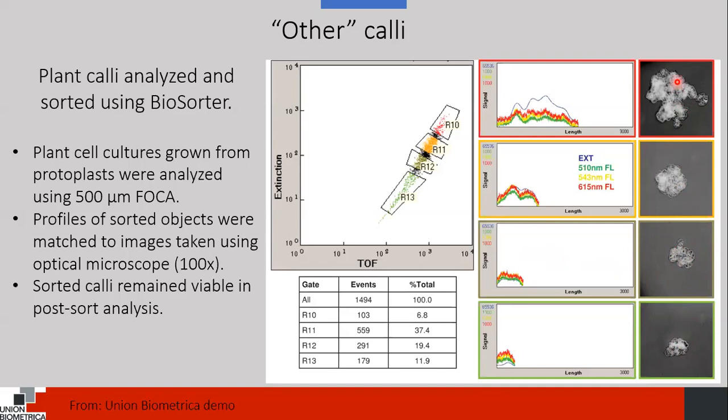And it's quite likely that cell clusters of different sizes are undergoing different kinds of biology. So these can be collected, RNA-seq experiments done to determine what genes are being expressed here and compare them to those that are bigger. You could set up this experiment where promoters are getting turned on as the cells start to differentiate and start moving along the path to redifferentiate into a plant, and take a look at what genes are being turned on and see if there's a correlation between the size and what gene is being turned on.